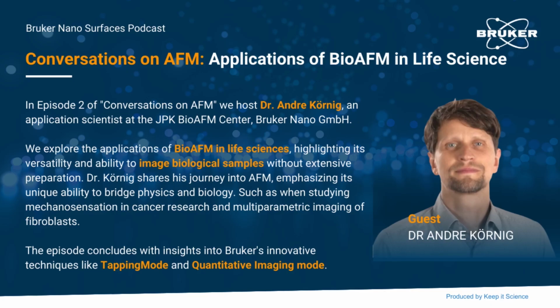But so this is about the fibroblasts, and the ebook chapter of course focuses a bit more on what the AFM is doing with it. This multiparametric imaging is basically what I mentioned before already. We now have access to not only see the topography of the cell. So how does it look? Is it rather large? Is it spread? Does it have a lot of fibrous network in it?